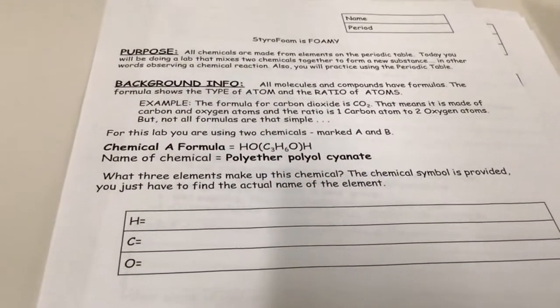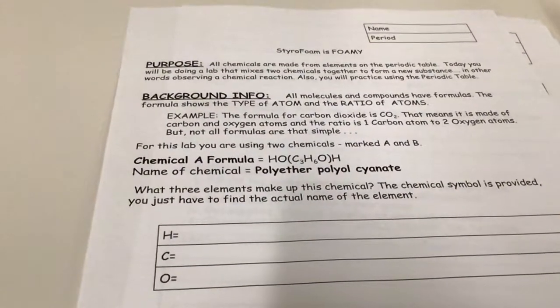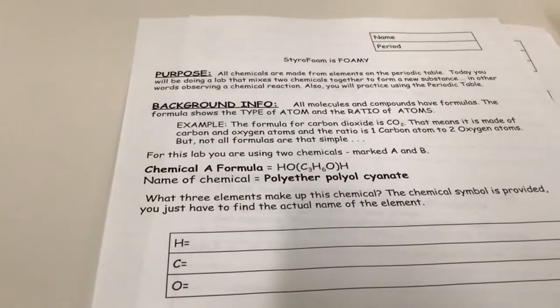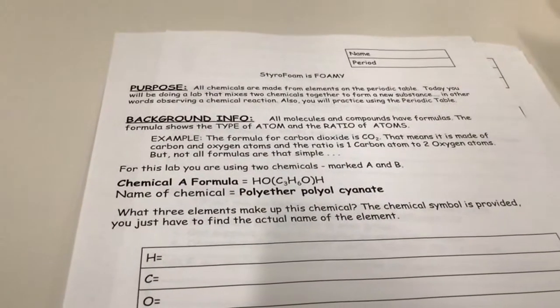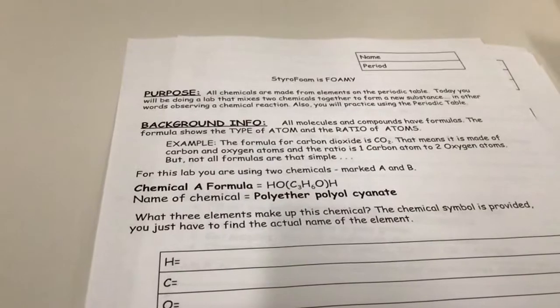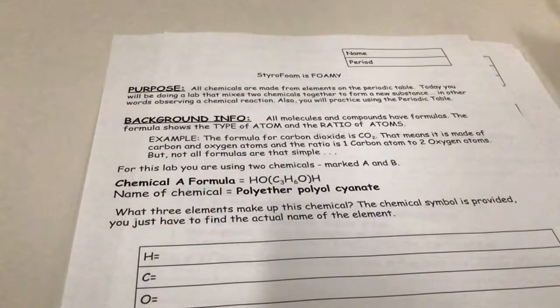The purpose of this investigation is to take a look at chemicals from elements on the periodic table, observing the mixes of two chemicals that will actually create a new substance. In other words, we'll be making a chemical reaction. We'll also be practicing using the periodic table.